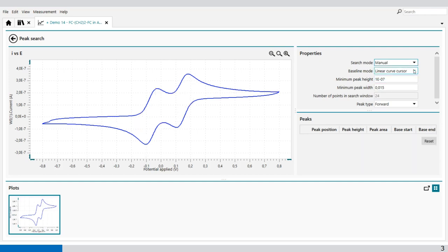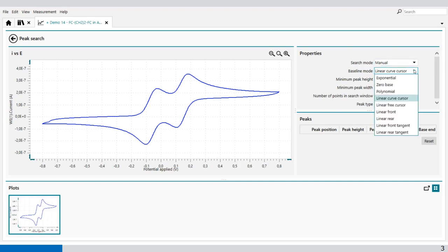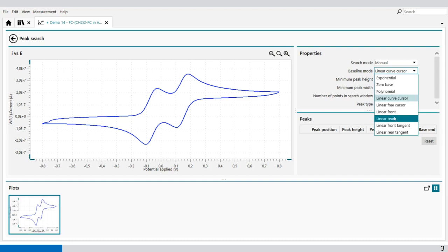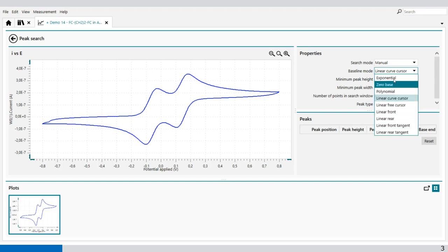This baseline we can set in a few settings: exponential, zero base, polynomial, linear curve cursor, linear free cursor, linear front, linear rear, linear front tangent, and linear rear tangent. Let's start with exponential.